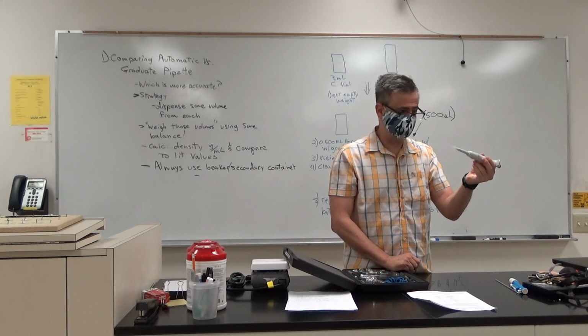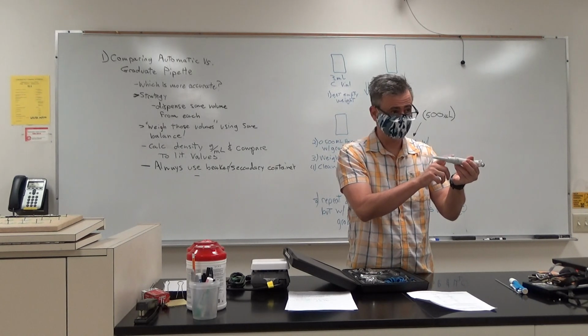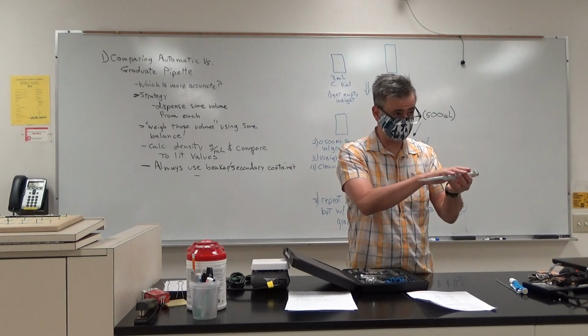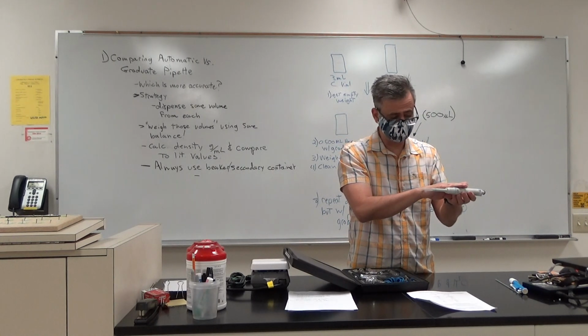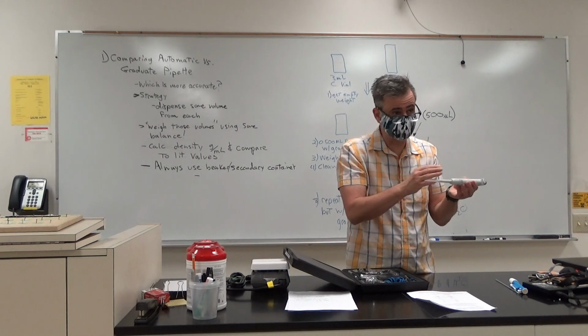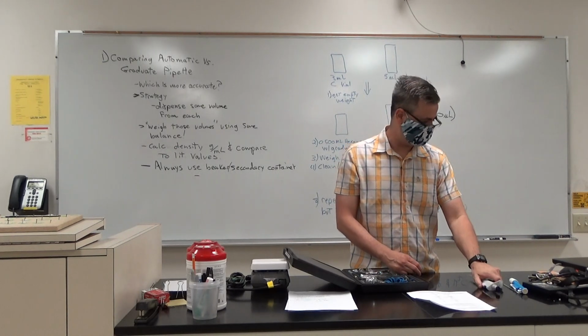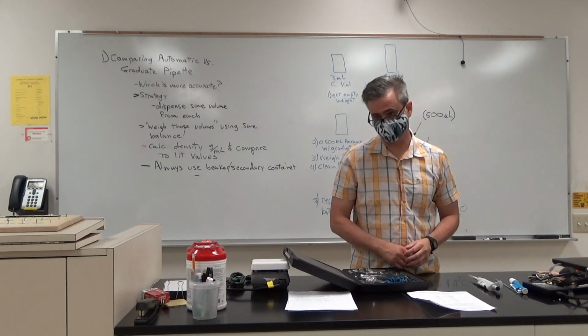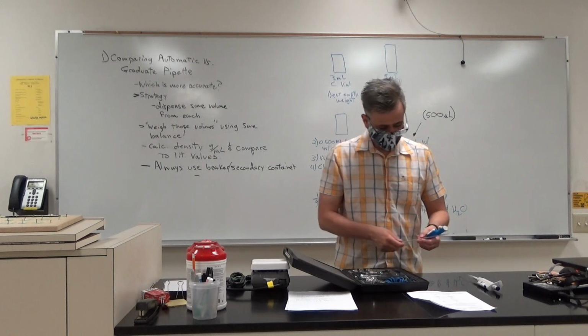Second of all, when you tilt it, the liquid starts to go up into the mechanism of this, and that can ruin it. These are actually shockingly expensive. It can ruin these, and it can also contaminate the next thing that you use with this. Again, that's true of all pipettes, including the disposable pipettes. So that's how you use that one.